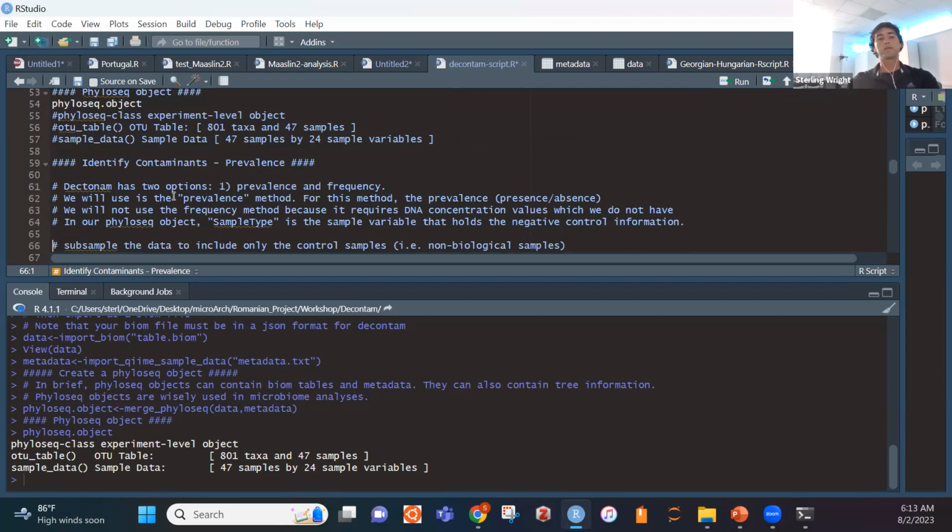All right, Horia, are you following along? I couldn't keep the pace, so I gave up. I prefer just to watch your screen. Okay, are you sure? Are you having an error? Well, it's much easier to watch your screen than doing it myself.